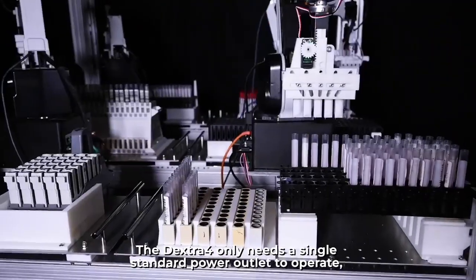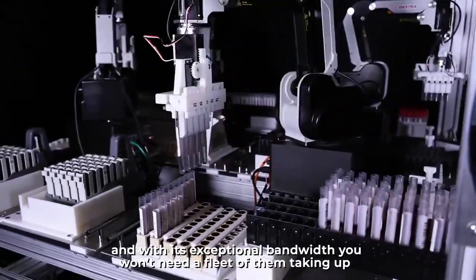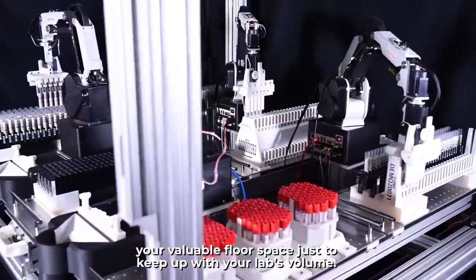The Dextra 4 only needs a single standard power outlet to operate, and with its exceptional bandwidth, you won't need a fleet of them taking up your valuable floor space just to keep up with your lab's volume.